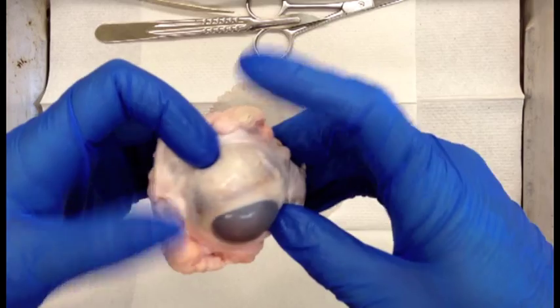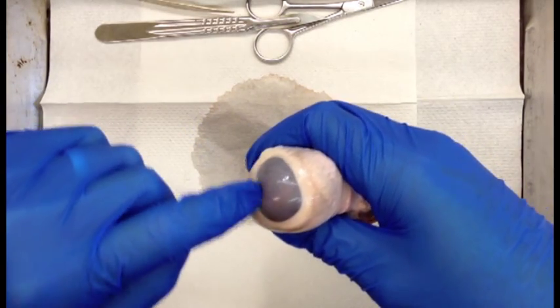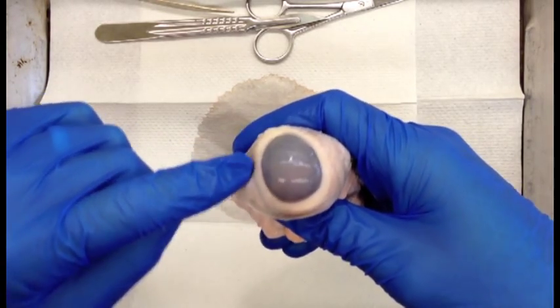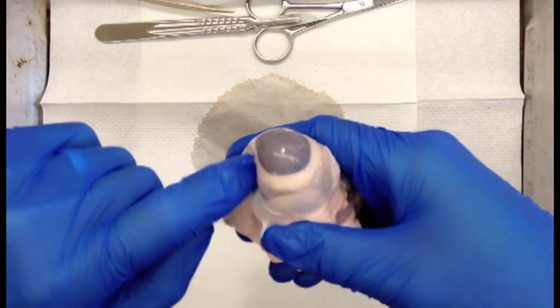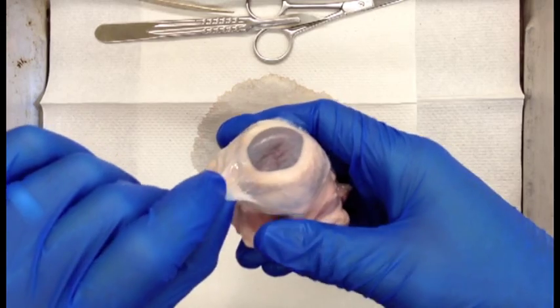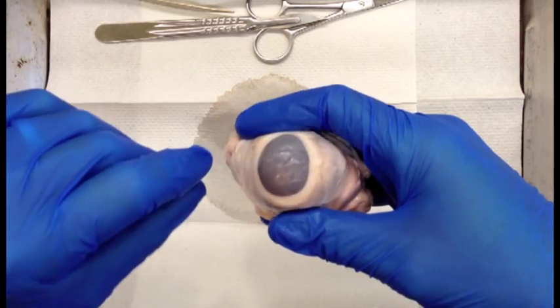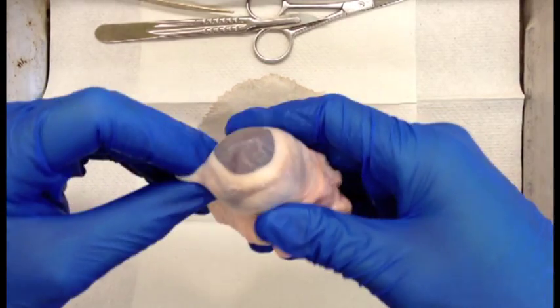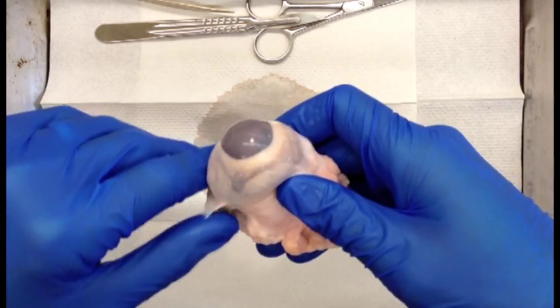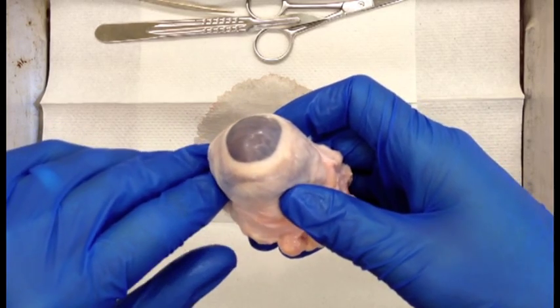Let's go ahead and look back at the front here. And so we've got the cornea here, the clear part that light actually enters into the eye from. And going back from the cornea, you can see all this white here, the white part of the eye. This is actually the sclera, which makes up the fibrous tunic, the really tough outer part of the eye that helps protect it. It actually makes the eye a fairly tough ball. So once you start to cut into it, you'll notice that this is a really tough structure. It's hard to actually get into it, and there are some tricks to get into it without it coming all apart on you.